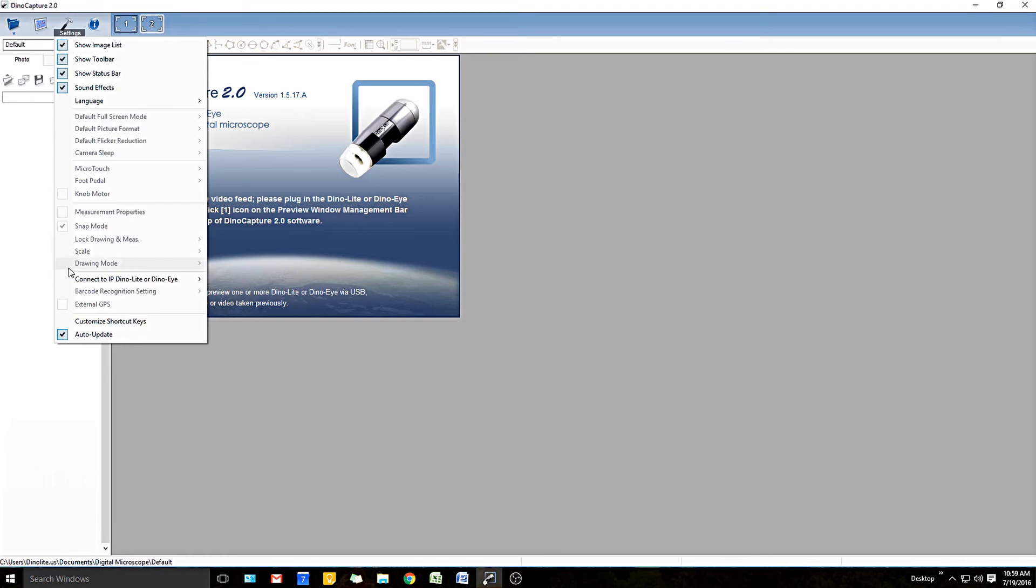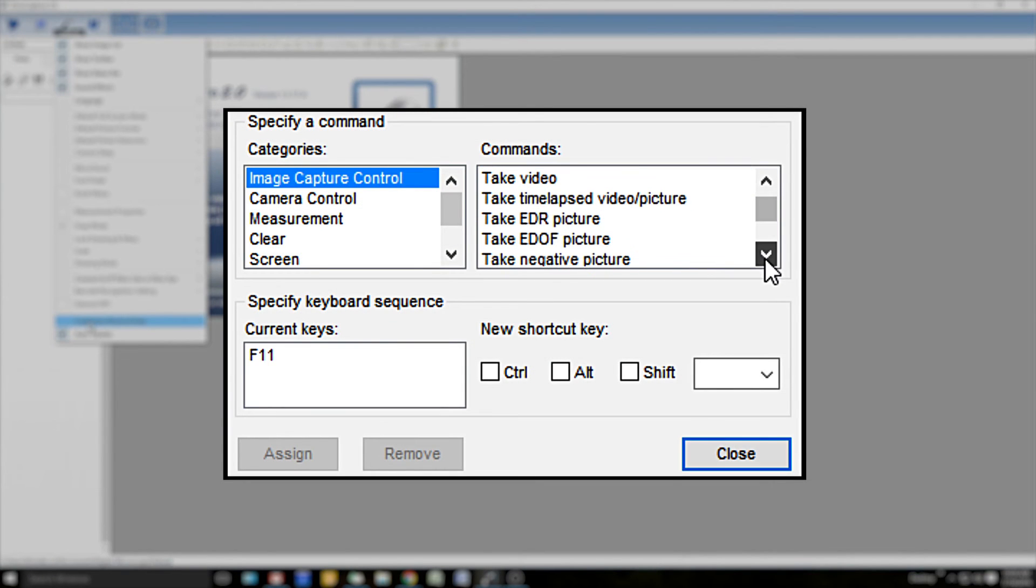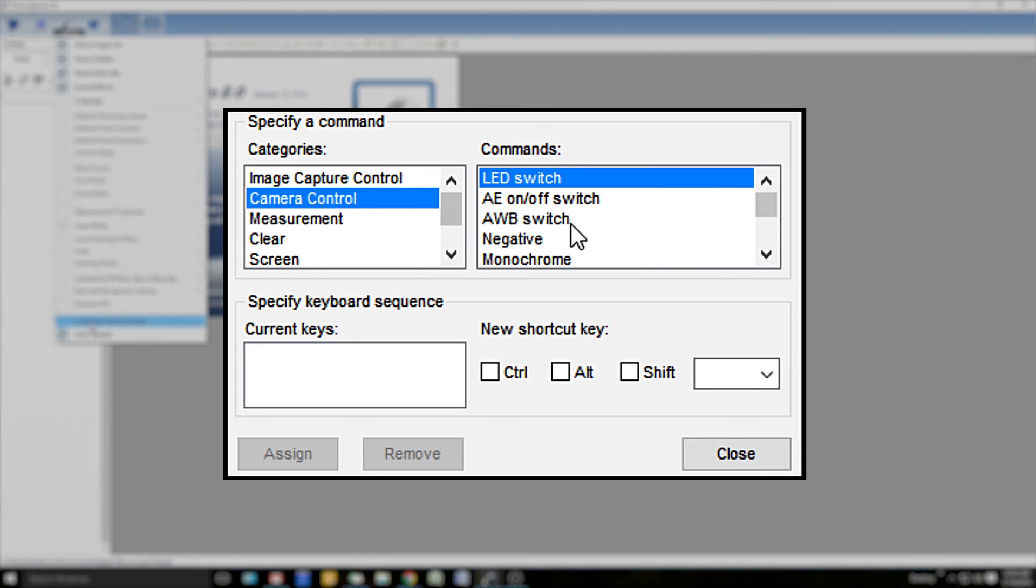The commands are broken down into categories for Image Capture Control, Camera Control, Measurement, Screen Size, and File Options.